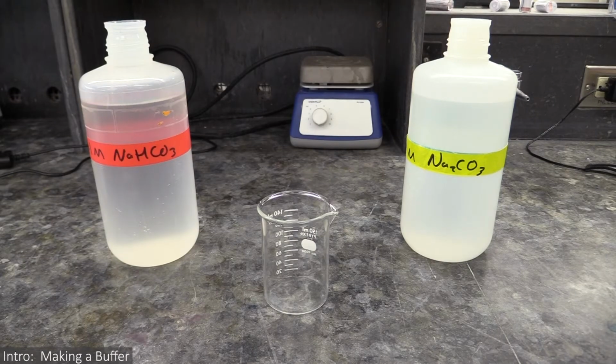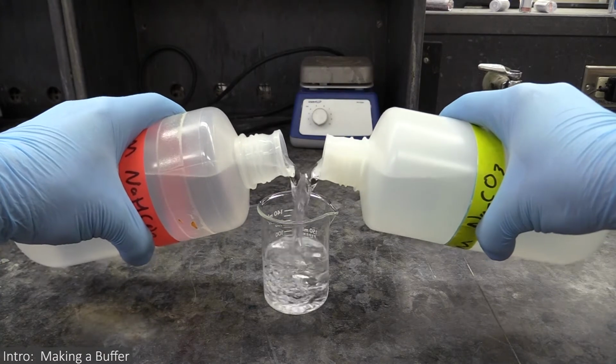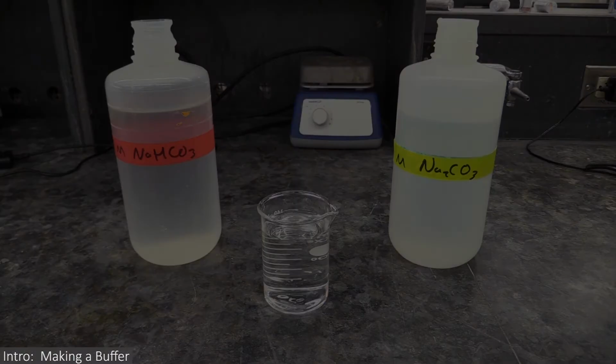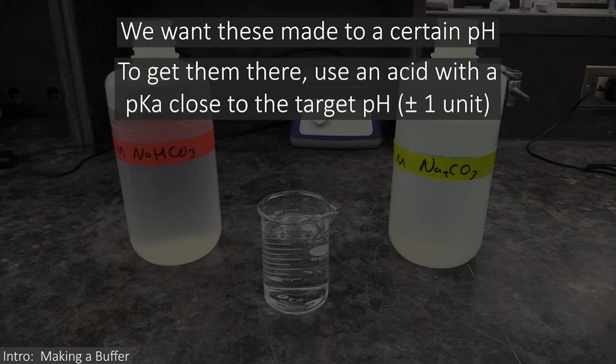And finally, how do you make a buffer? You know part of the answer to this already. You mix a weak acid together with its conjugate base, like we did with the bicarbonate and carbonate. However, there is a little more to it than just that. More often than not, buffers need to be made to a certain pH or at least close to a certain pH. To get them there, you need to use an acid that has a pKa within 1 unit of your desired pH, and ideally as close to your target pH as possible.